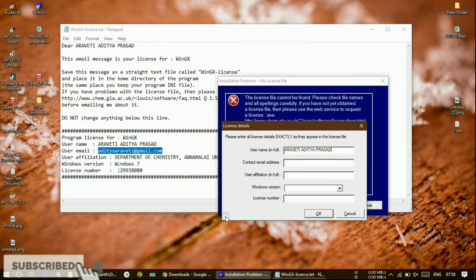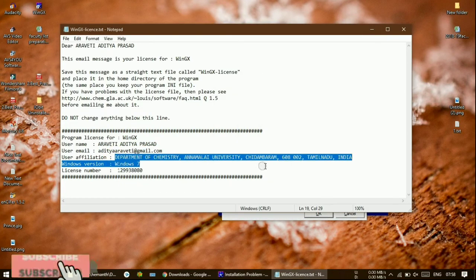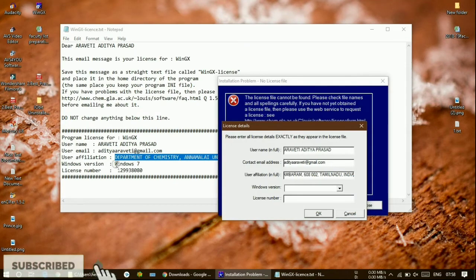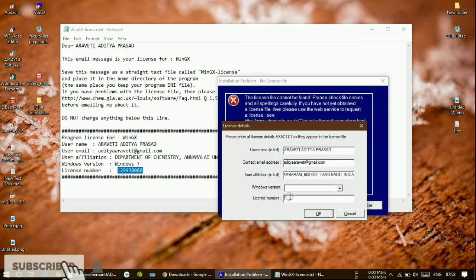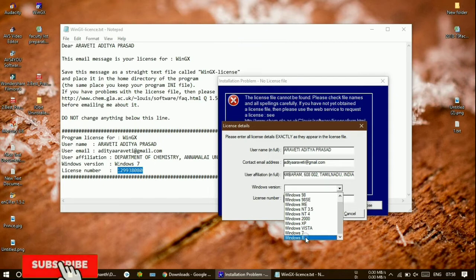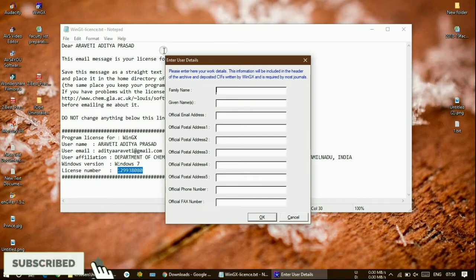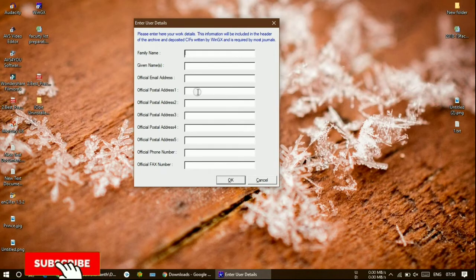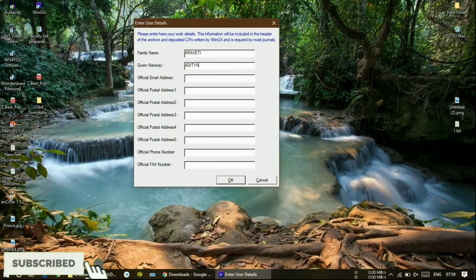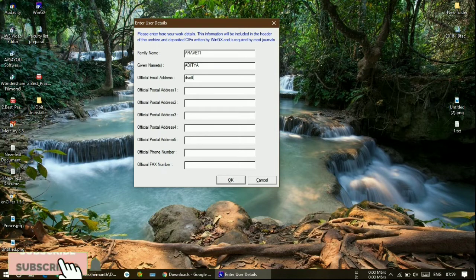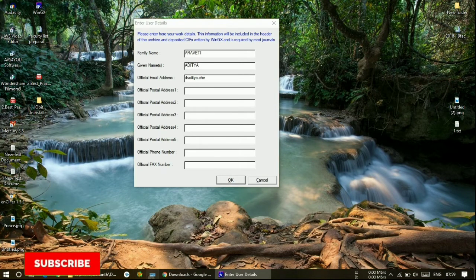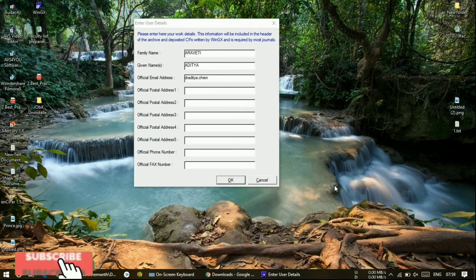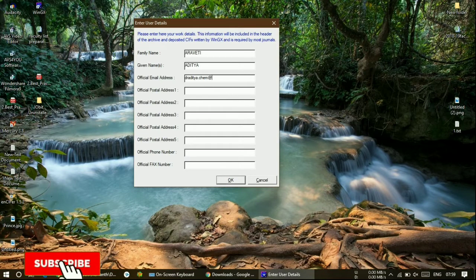This is my license file — don't use this. I am just copying all the license file details: application details, Windows version, everything you can give here. Just click OK. Afterwards, we need to give our details — wherever we are working, our name — everything we need to fill out here. I am just clicking OK.